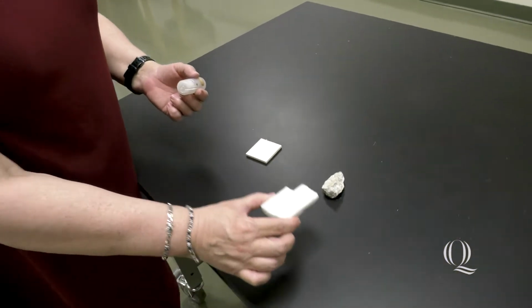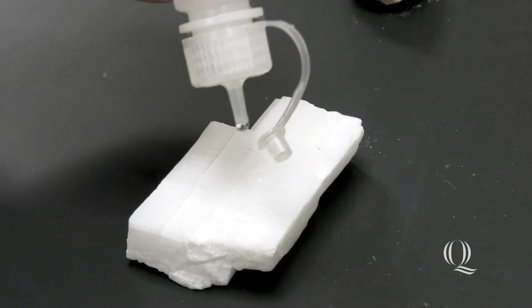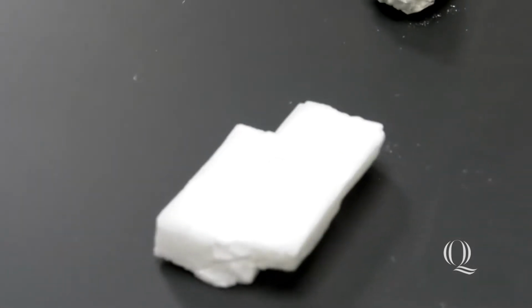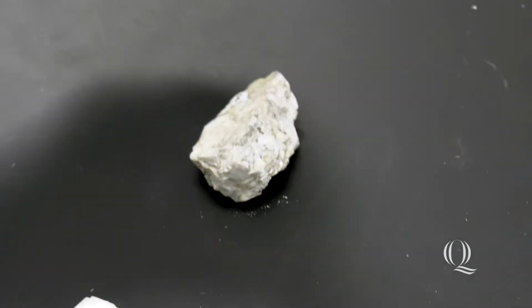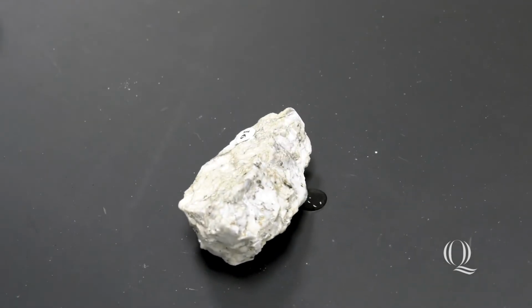This sample here is my calcite. And as you can see, when I put hydrochloric acid on there, it fizzes. You can see the bubbles that are popping up on the mineral itself. So it's effervescing, the mineral is reacting to the acid. When I do the same thing to this piece of dolomite, I don't get any reaction.